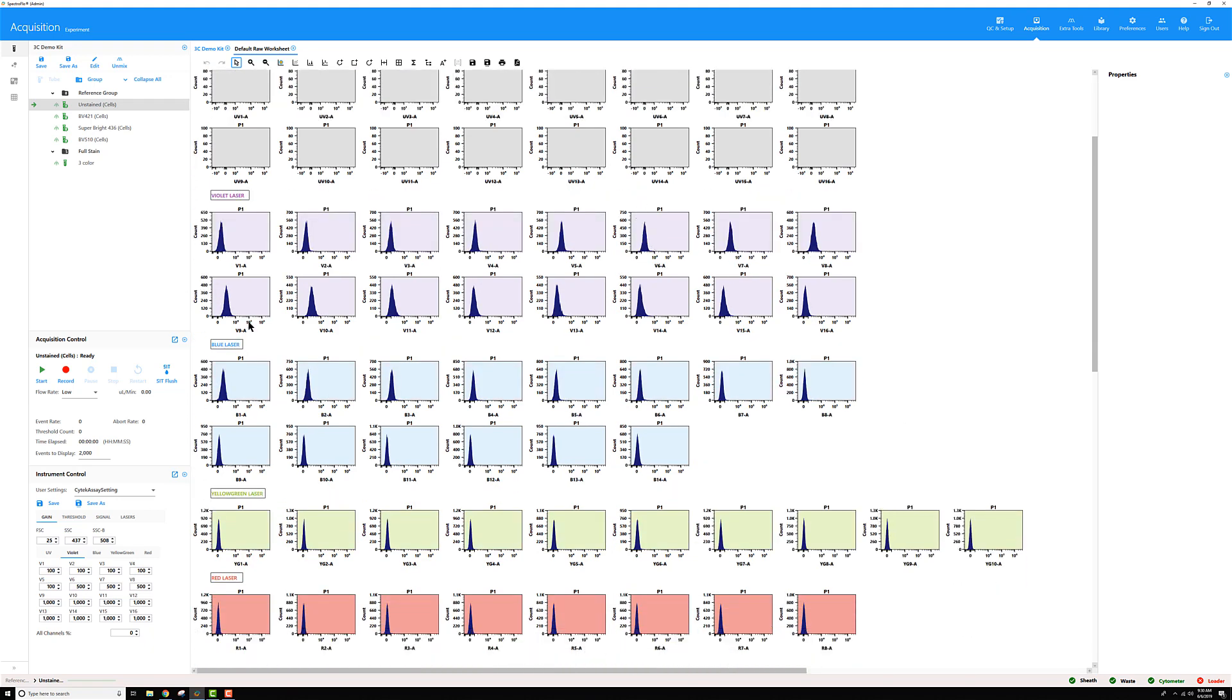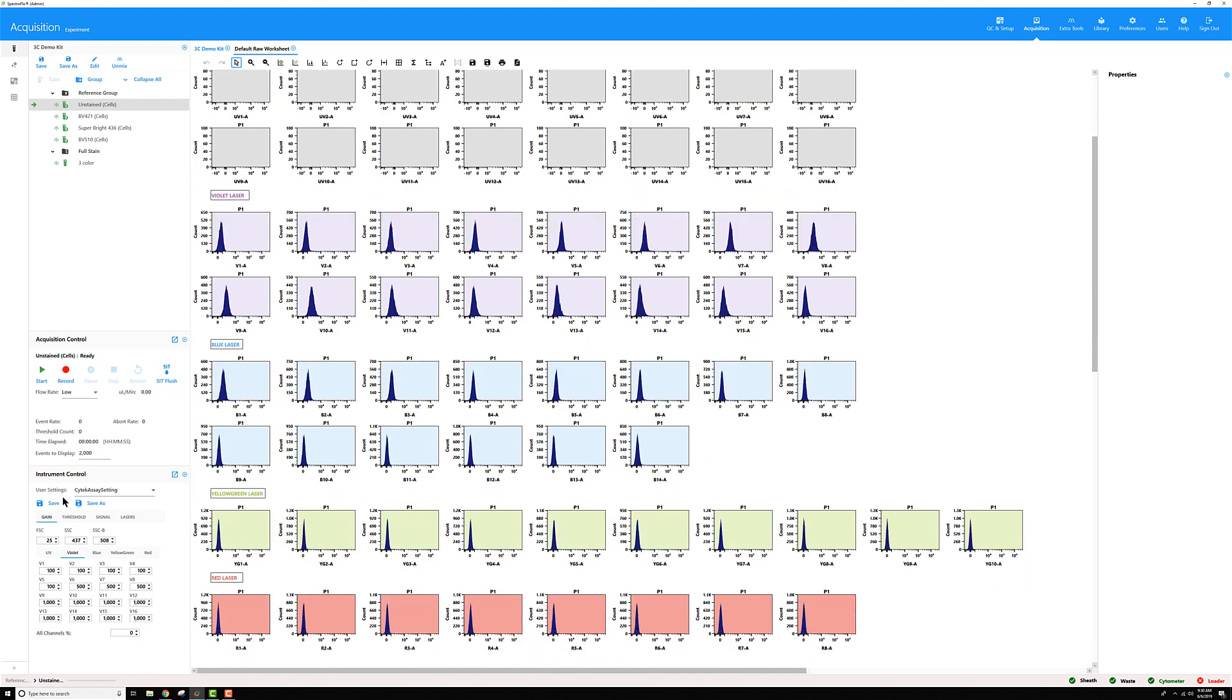Same thing for the system defined user settings. There are only two system defined settings currently in our software. One is called default and one that you should be familiar with is the SciTech assay settings since that's what we recommend using to record all of your events and at least a starting point for your assays.